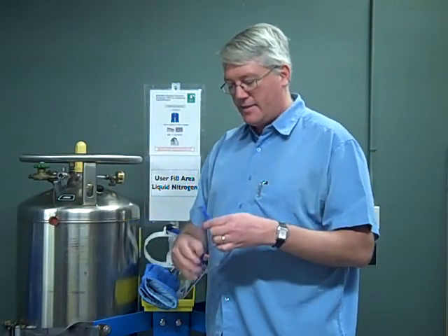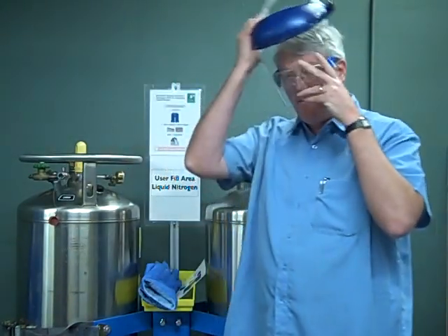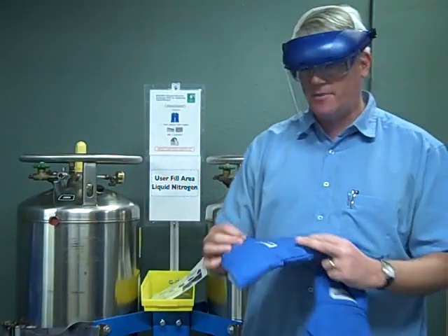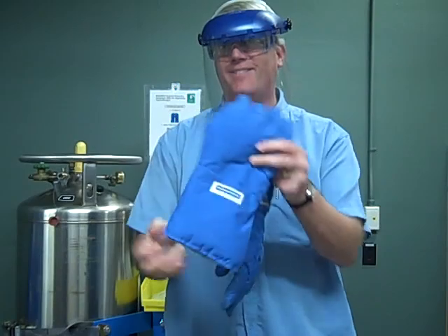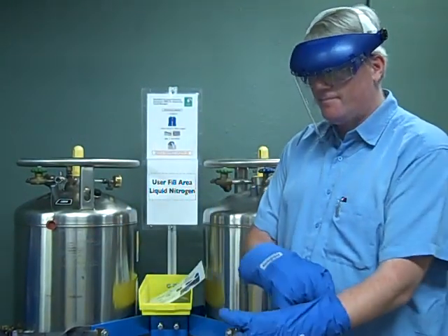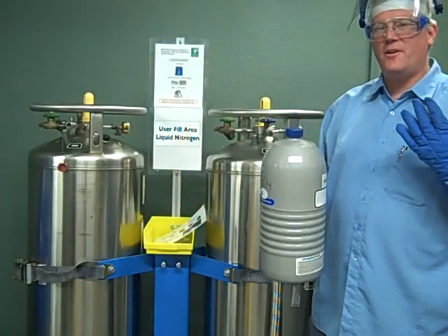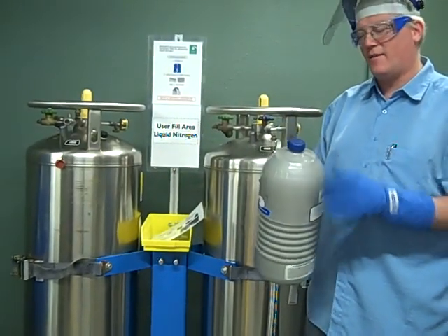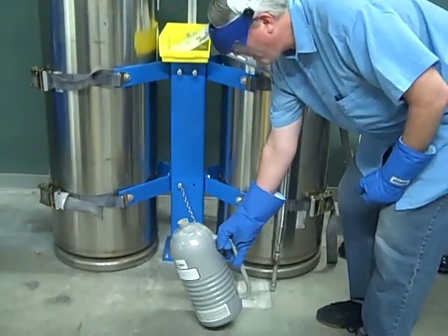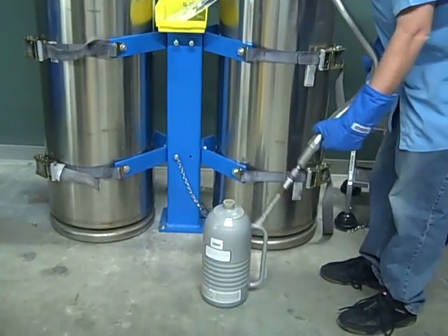So we have our safety glasses, full face shield, and cryogenic gloves — these are labeled cryogenic. Now that I have all my safety equipment on, we're going to go ahead and start filling. I'm going to take off this cap, set it on the ground, and put this transfer line into the dewar.